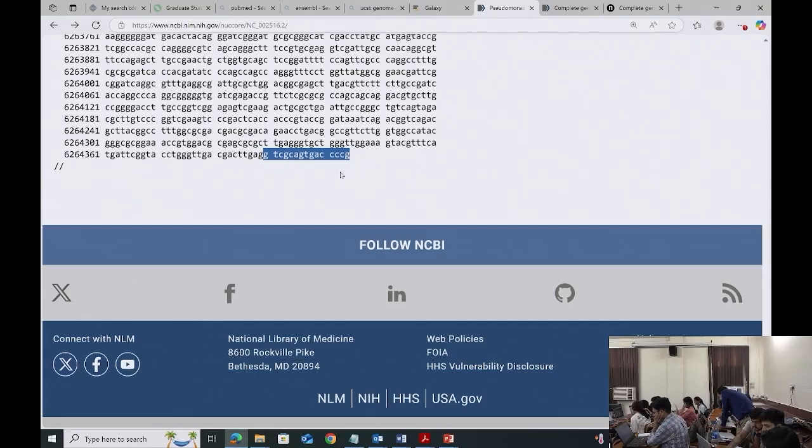I don't know, because this is just about 2000 base pairs, so I think it is not the right one. This is just showing the region, not the complete genome. So of course this is from the complete genome, but just a region. So go back.